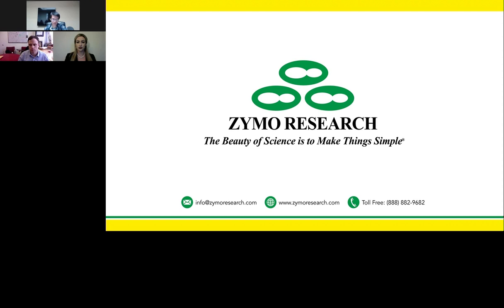I cannot comment on the performance of the DNA extraction kit from the MetaHIT because we did not include that in our study. But the MetaHIT protocol seems, based on my own opinion, to be more accurate, although the workflow seems less streamlined. So I hope that answers your question.